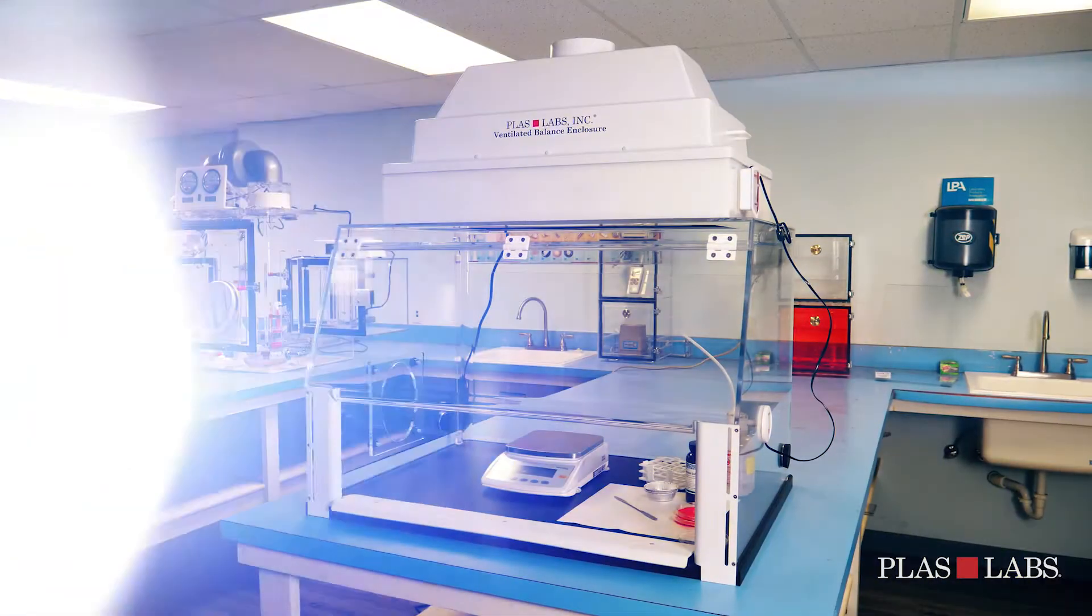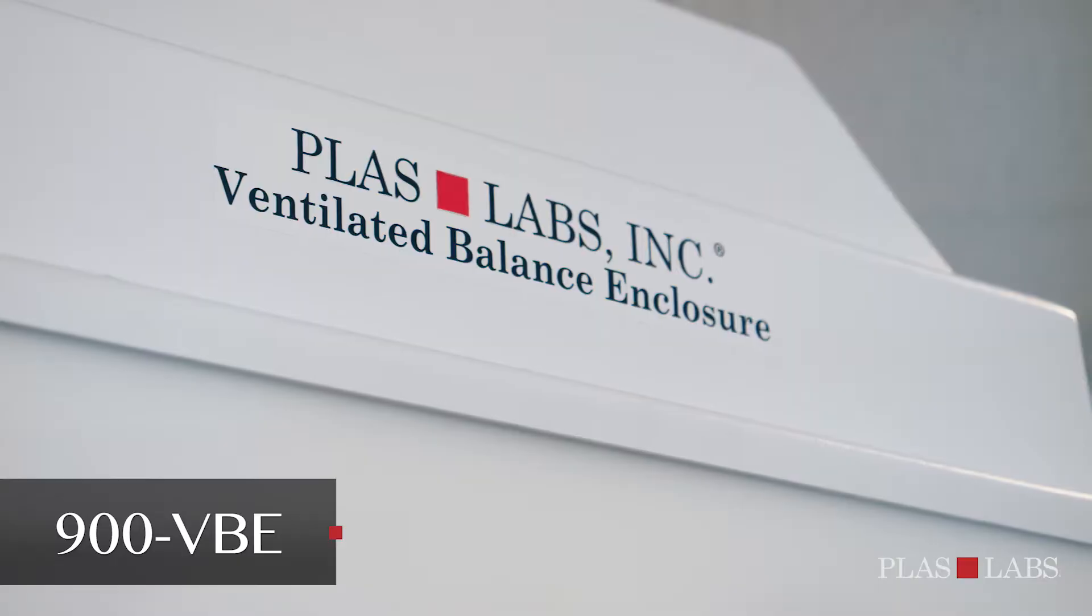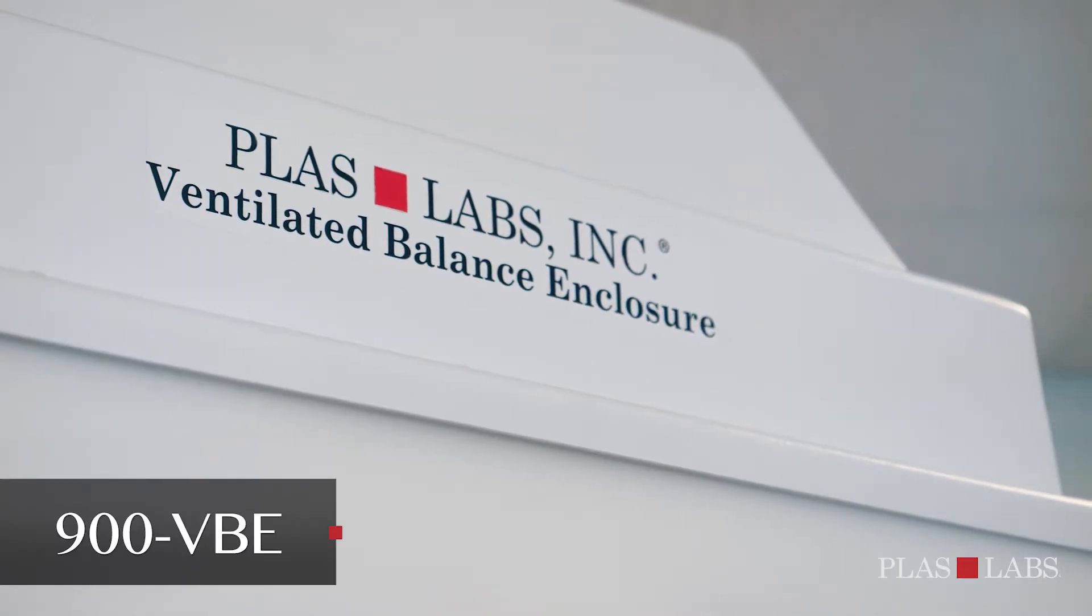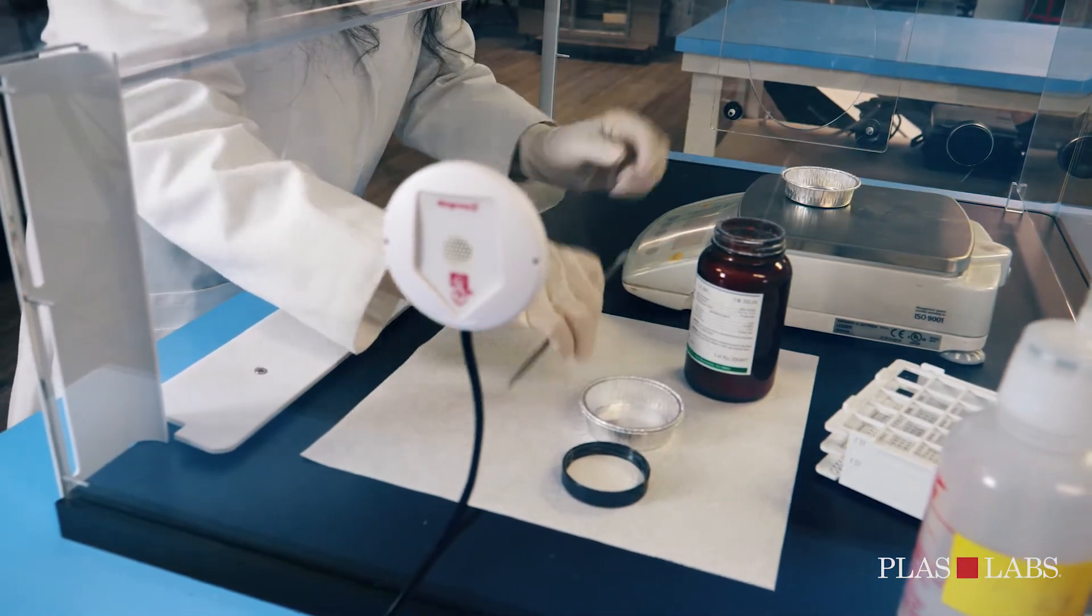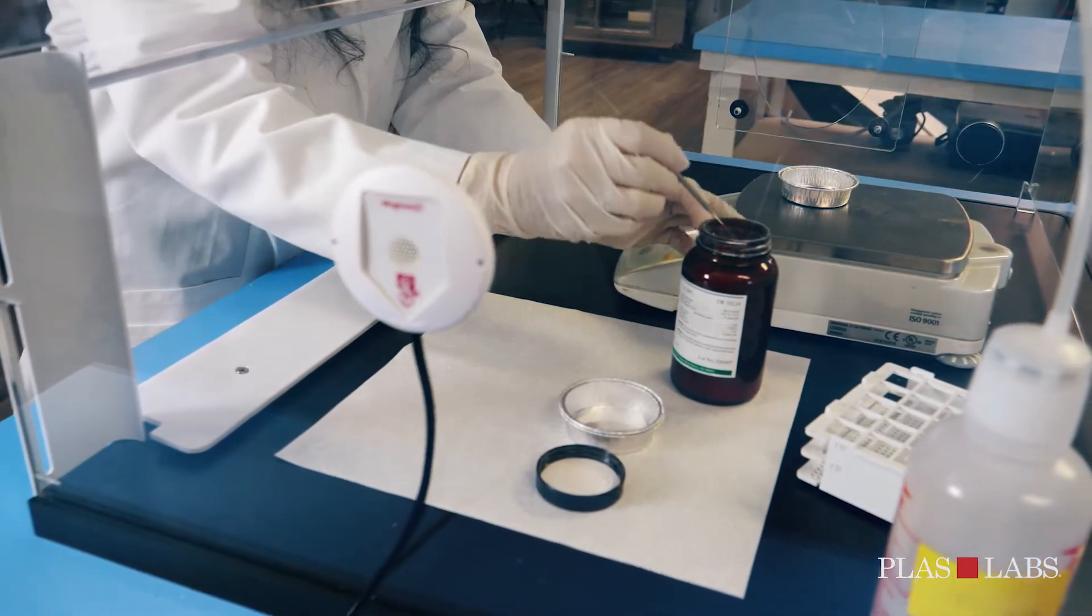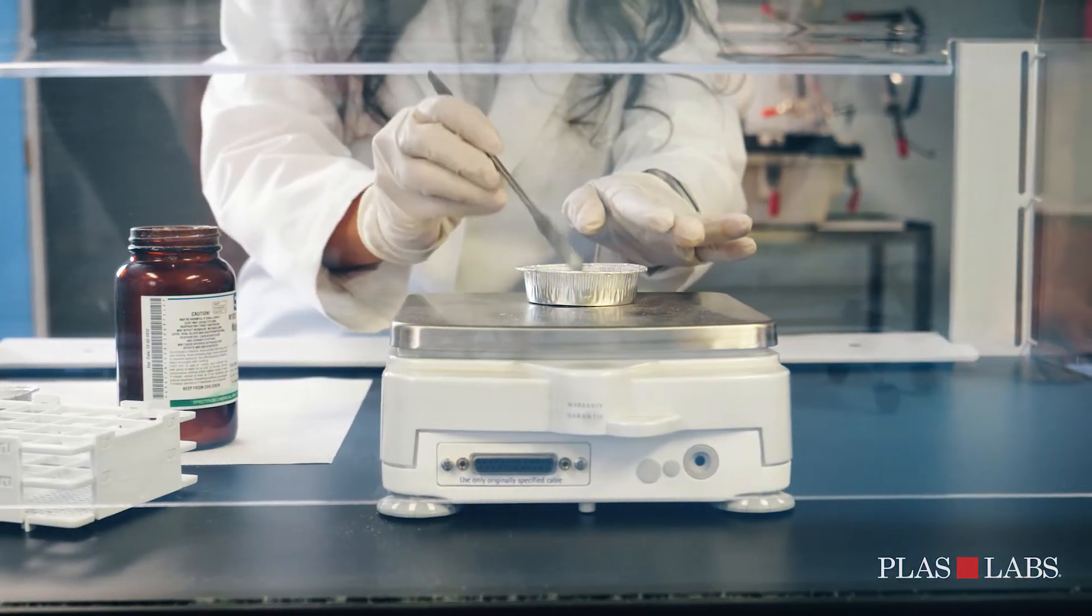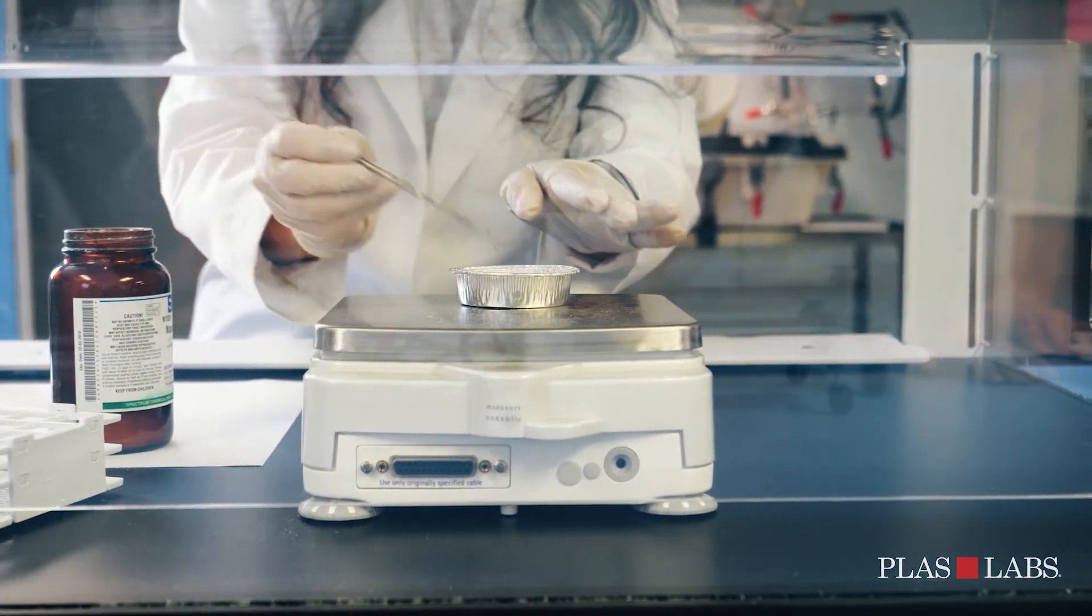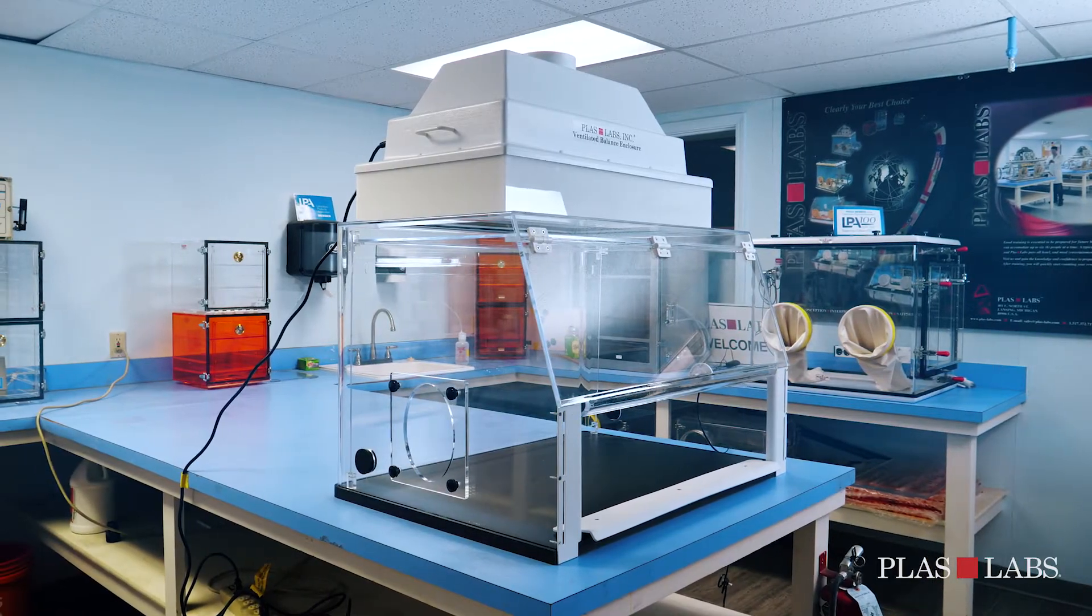Our latest developments include top-mounted HEPA filtration ventilated balance enclosures. The 900 VBE series is designed by PlasLabs for self-contained laboratory processing. These ASHRAE 110 compliant portable ventilated balance enclosures include a top-mounted HEPA filtration system and blower for working with fine powders.